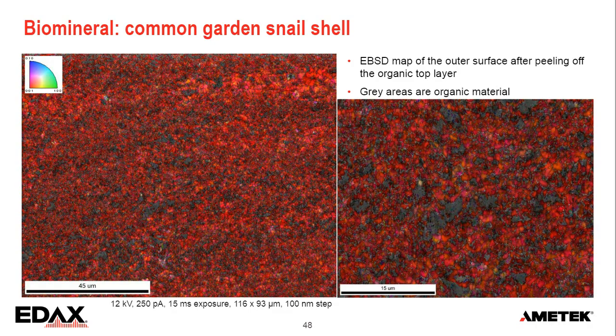It is something that I also have been experimenting with. I have been able to get good diffraction patterns at 3.5 kV. So we're pushing the limit to go a little bit below that, which is almost impossible with a phosphor screen, because it doesn't produce much light at those low voltages. But yeah, down to 3 kV I've been able to do. But much below that, not really.